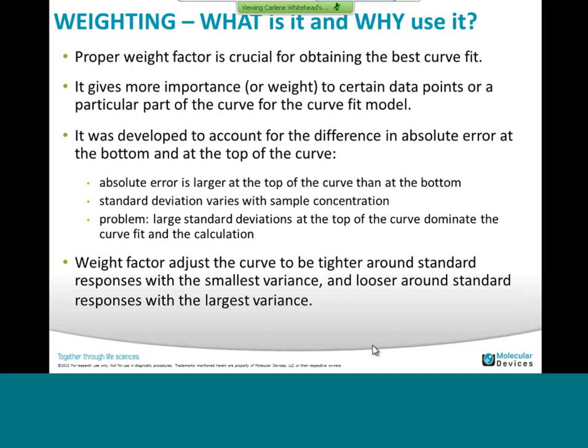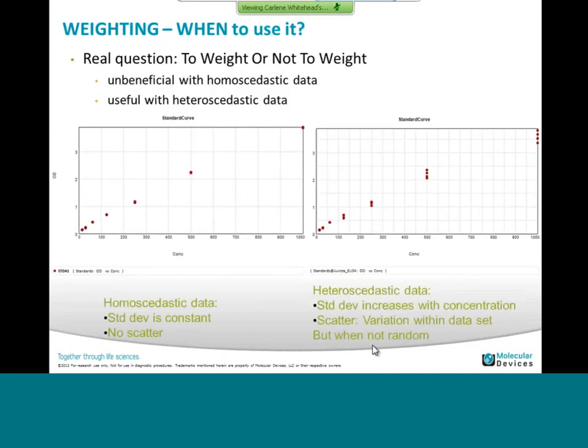The problem arises from the fact that the large standard deviation at the points at the top of the curve dominates the curve fit, and therefore the calculation of the curve parameters. Therefore, choosing the proper weight factor will allow you to adjust the curve to be tighter around the standard responses with a smaller variance, typically those with a smaller response, and looser around the standard responses with a larger variance, typically those with a larger response.